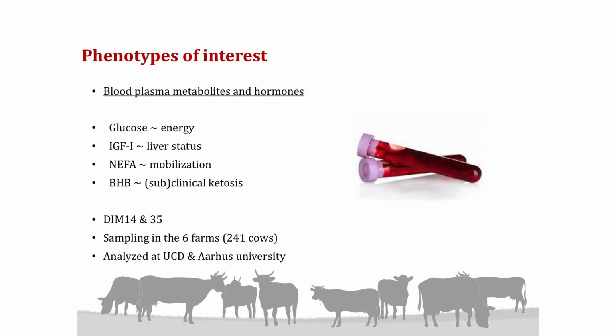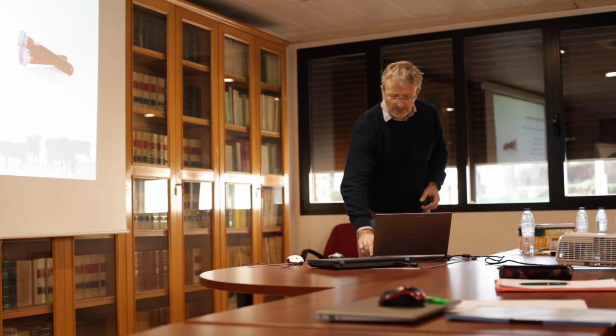For the blood measurement, we did the measurements 2 times, at 14 days and at 35 days. And we made the sampling in the whole farm, and we measured this reference analysis in 2 different labs, in Dublin and in Aarhus.